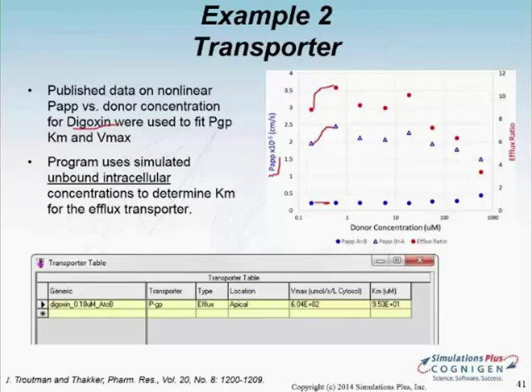Just quickly, the thing that I would wonder about too is, if you have a low expression of CYP3A4, 3A5, which has been shown in a number of studies, then it may also influence P-gp function as well as other efflux proteins involved in conjugates. I also know that a lot of times you try to use butyrate to stimulate it. So making these assumptions, I'm really concerned, how do you account for some of these things? Because the butyrate will also change the cell function significantly.